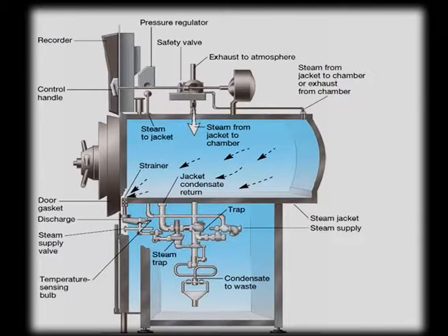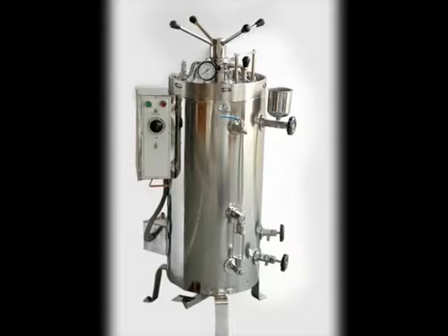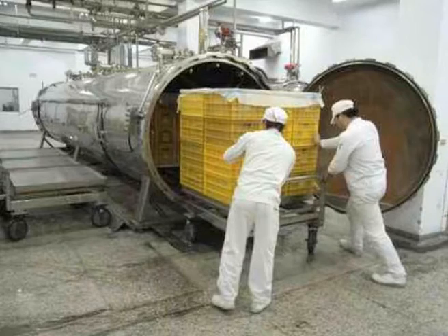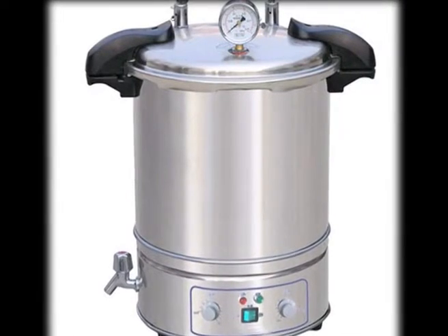The principle of the autoclave is that here we keep on boiling the water, and this boiling water generates steam. This steam pushes off all the cold air, or the normal air, that was present inside the autoclave chamber. Then the chamber is closed and the steam inside the autoclave starts increasing in pressure. With the increase in pressure, the temperature of the autoclave starts rising, and it is allowed to reach a temperature of 121 degrees centigrade and a pressure of 15 pounds per square inch.